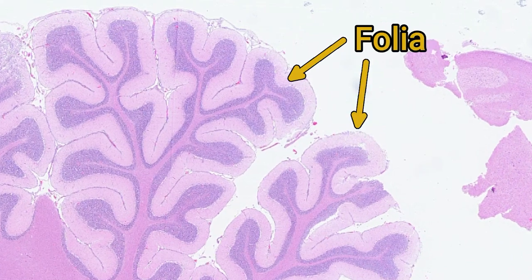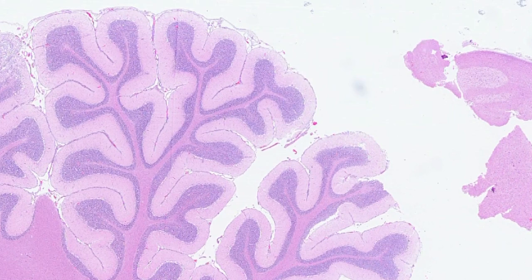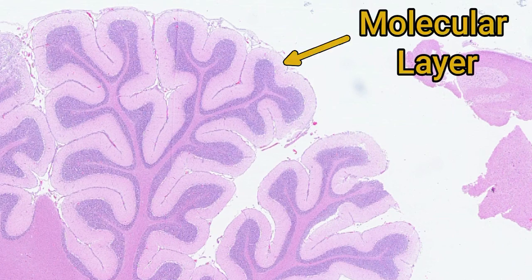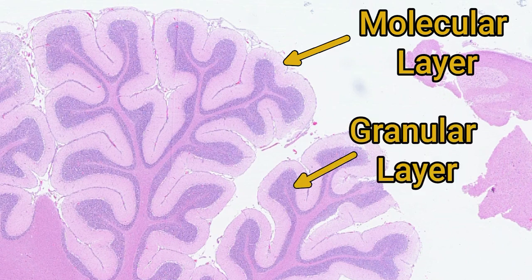The structure of the folium is based around three layers of cortex that cover the white matter core. At low power you can see two of these layers: the molecular layer, which is not very cellular and therefore pink, and the granular layer, which is very cellular and much more blue-purple.